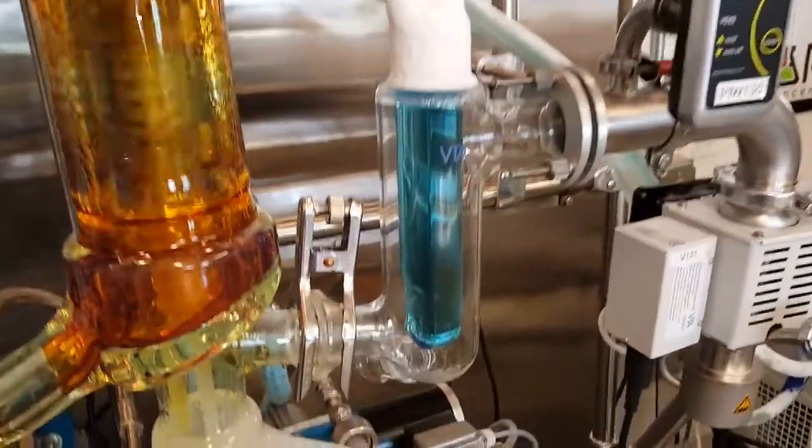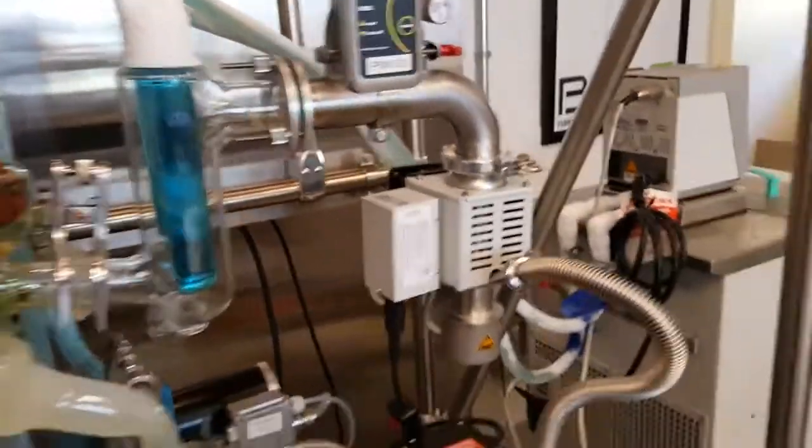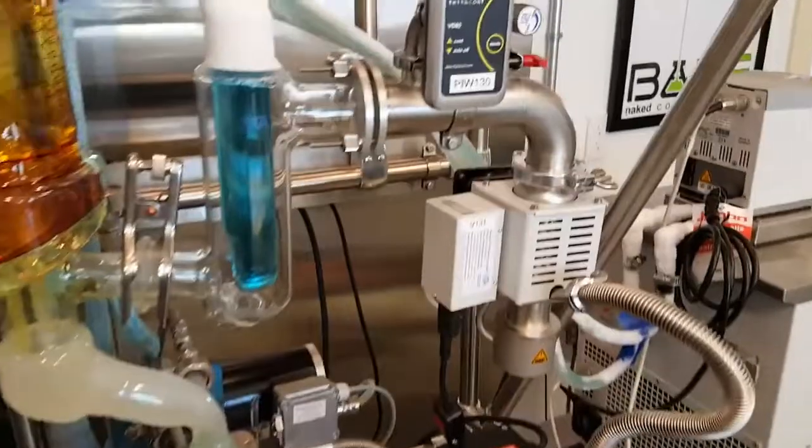Up here is the cold trap. Instead of having dry ice, they've got a chiller pumping that blue stuff in there, and it condenses anything before it goes into the pump.